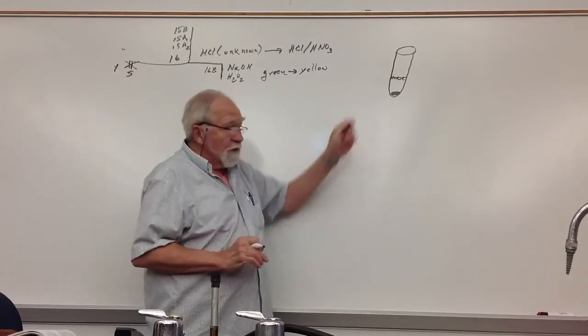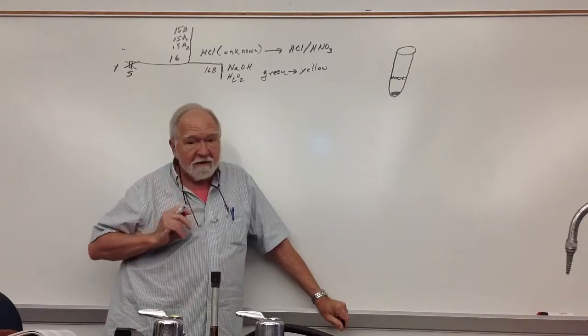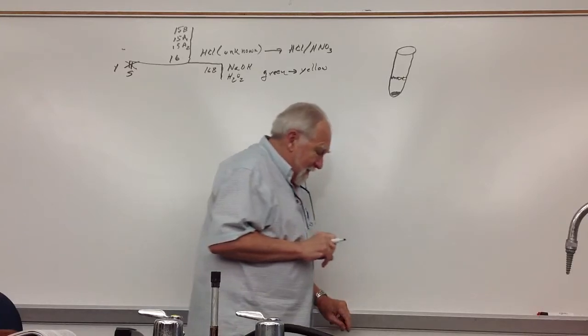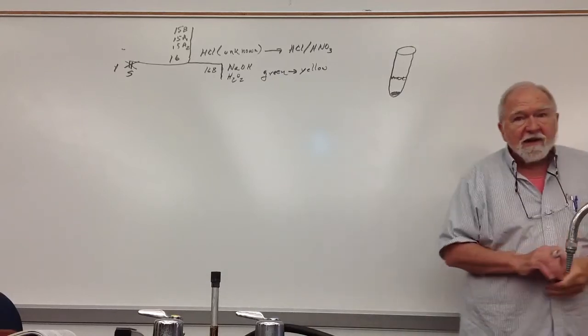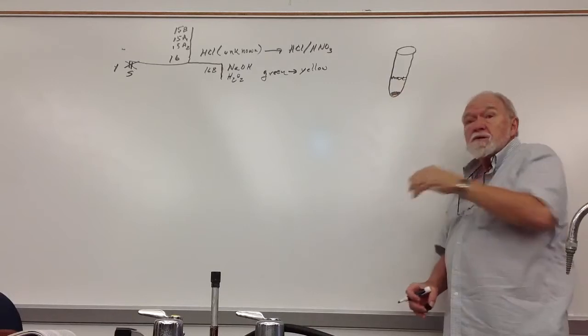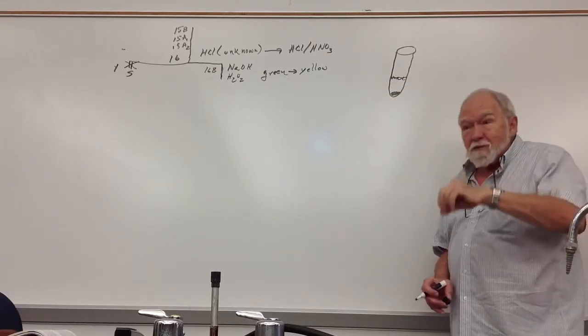So you add some more. Where is that important? I think I'm seeing what people are bringing me for the cyanide test. In procedure 9, when it says make it distinctly alkaline, you add a little bit of NH3 and it turns dark blue, and you stir it up and the dark blue color goes away. So you add more ammonia.